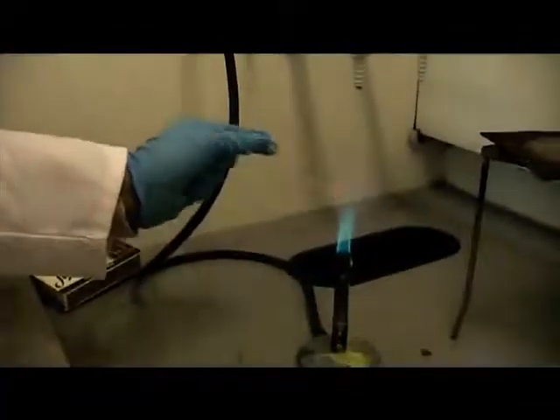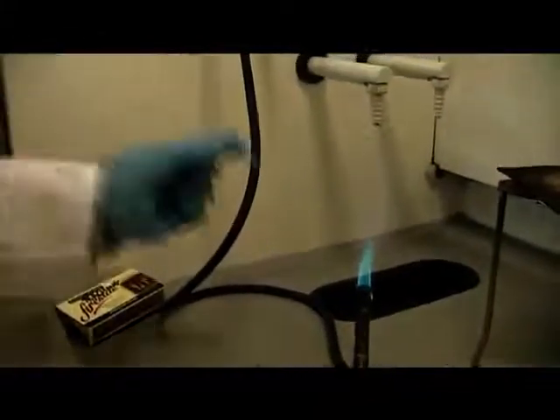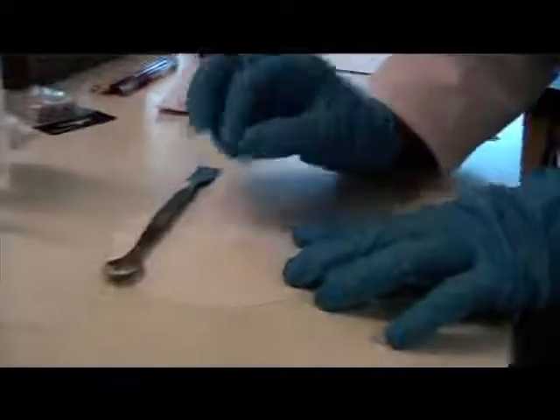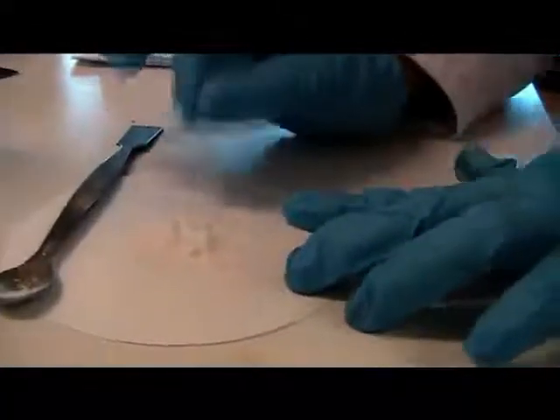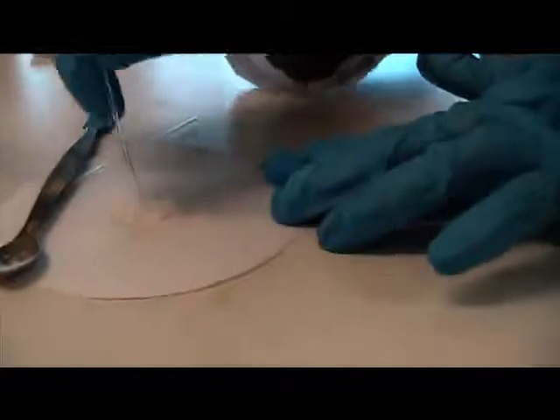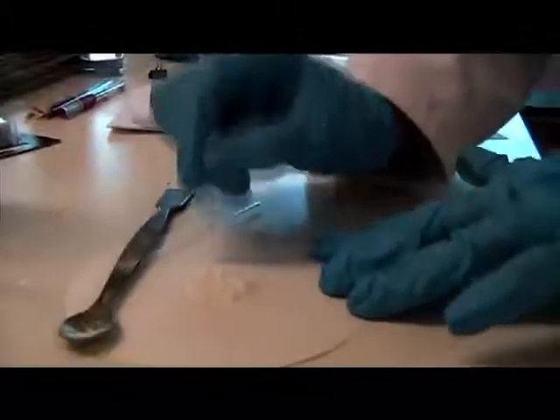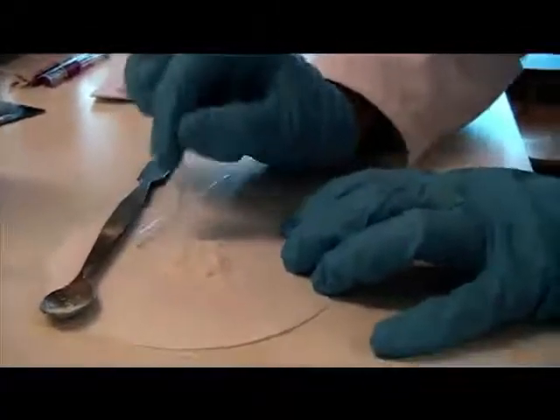So we're going to make our little tubes to determine our melting point, so then we can determine what our carboxylic acid is. Okay, so Vicky is filling our little tube to get our melting point. Takes forever. And then once we do this, we're doing this so we get a good reading. So once we find out what our melting point is, then we will know what our compound is by looking it up on the table.